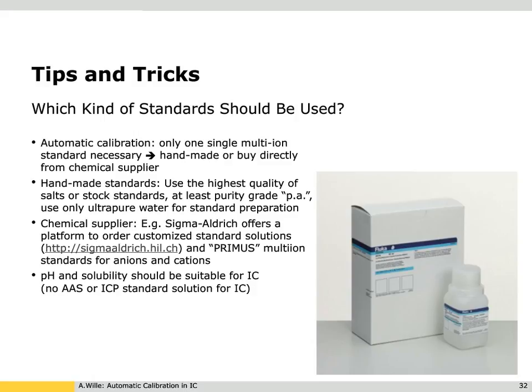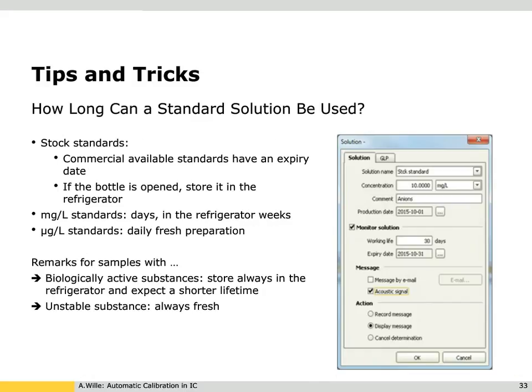Another point which I show you here is how long can a standard solution be used. The commercial standards which are available, they have expiry dates, so that's quite easy. And if you have opened the bottle, store it in the refrigerator. For handmade standards, milligram per liter standards, I would say you can use it for days.